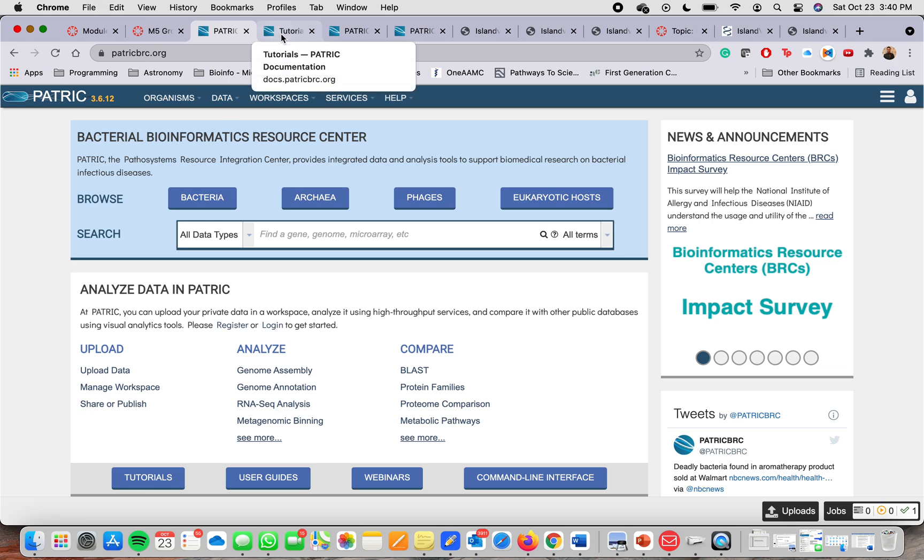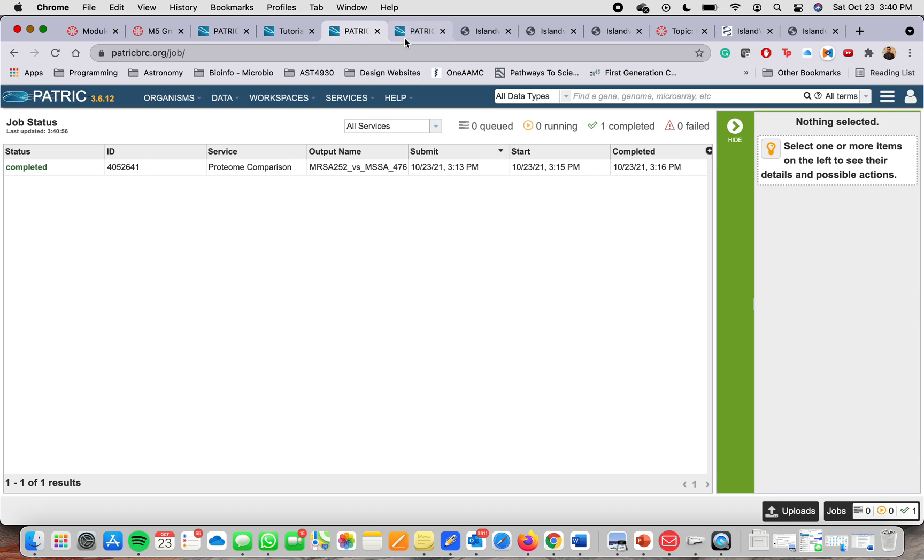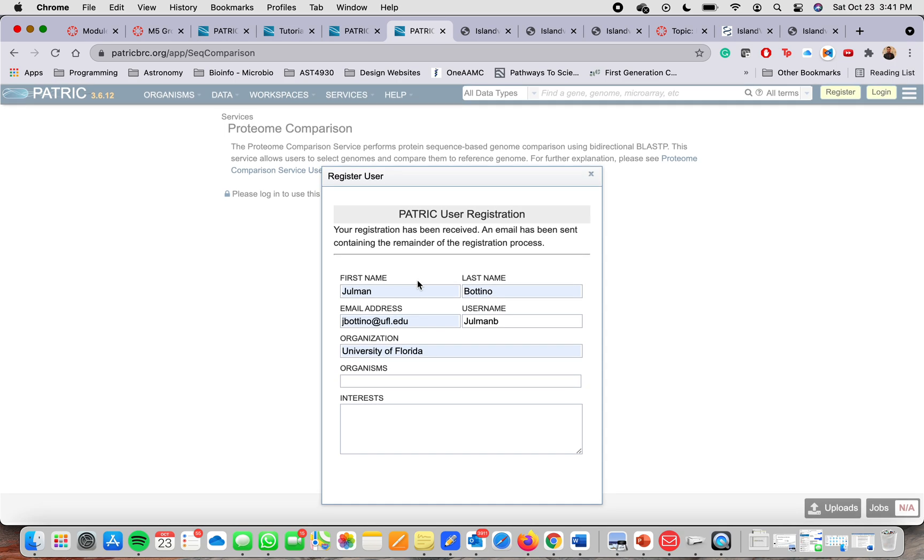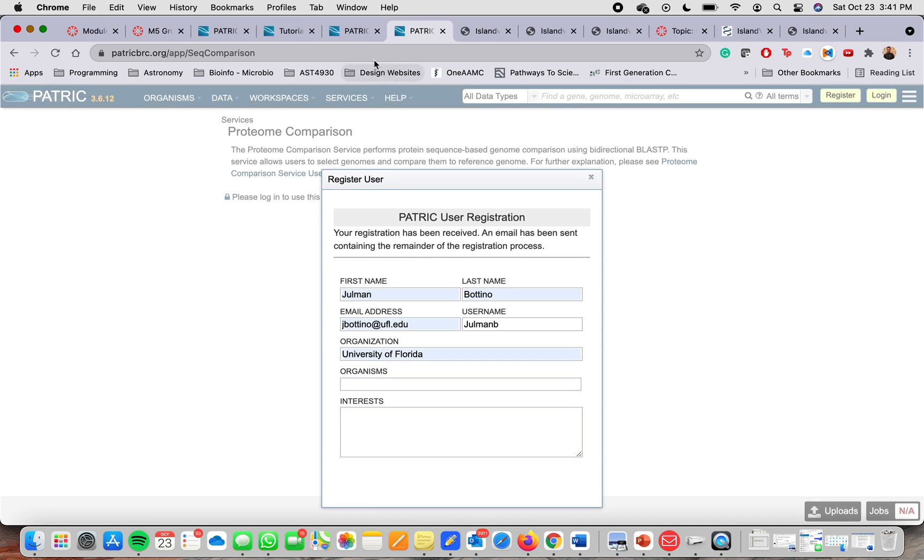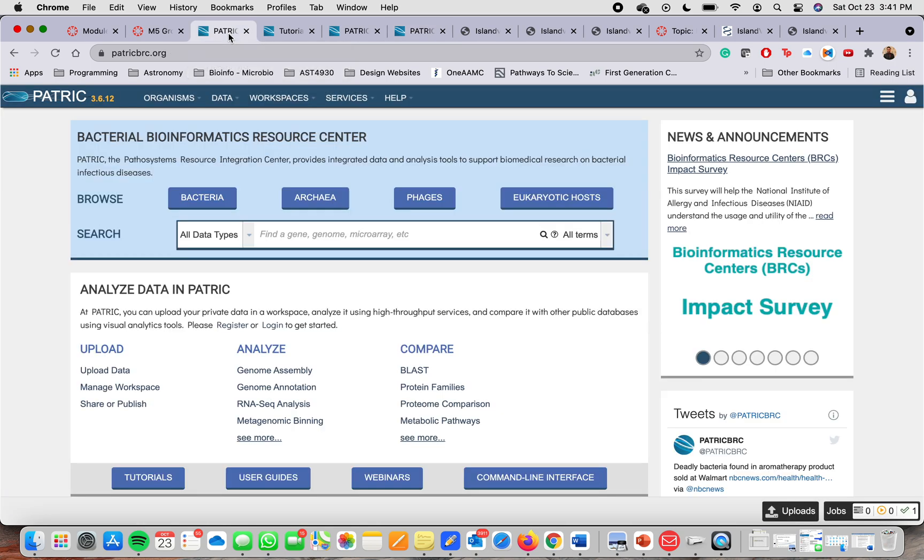So for this one, you will have to create an account. I had to create an account. I use my name, my last name, my email address, username and organization. And then you click register. It will send you an email. You confirm the email and then you're all set. It's really simple.